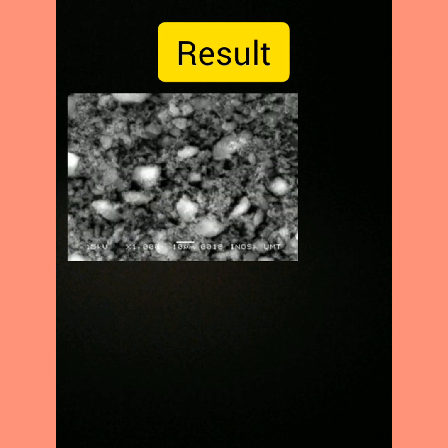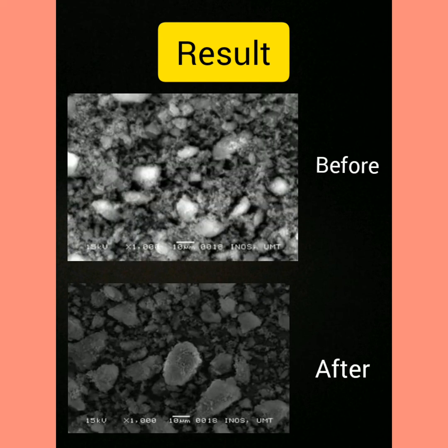This is the result of the molecular imprinted polymer under the scanning electron microscope, and it shows that the morphology structure of the molecular imprinted polymer after Soxhlet is less rough compared to the molecular imprinted polymer before Soxhlet. This proves the Soxhlet process is successful in removing the template, which is BPA.